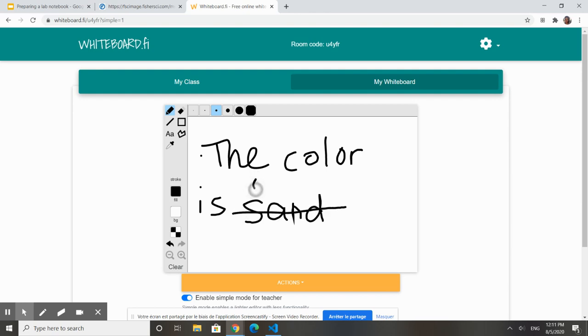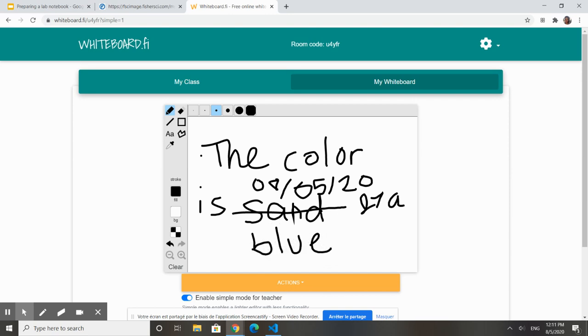I put today's date. You don't have to put the zeros in there. That's just my personal preference. You put your initials. So I'm putting JTA because those are my initials. And then wherever you have room, you put your correction. But I need to see what your mistake is. That just ensures that students aren't making up results. And that's actually not, again, my rule. That's a commonly used rule in other sorts of lab settings.